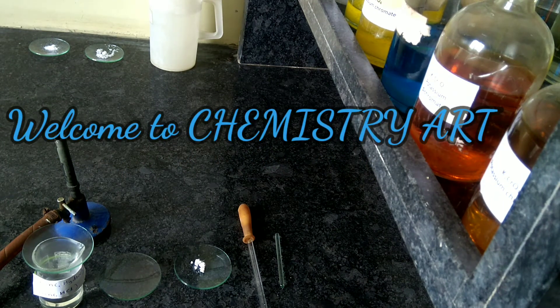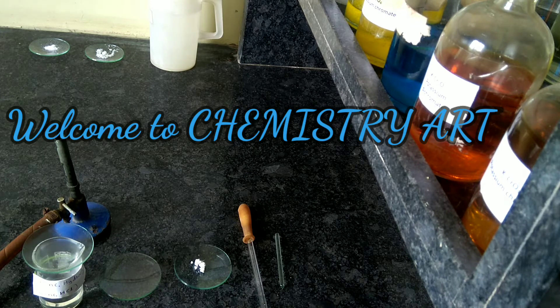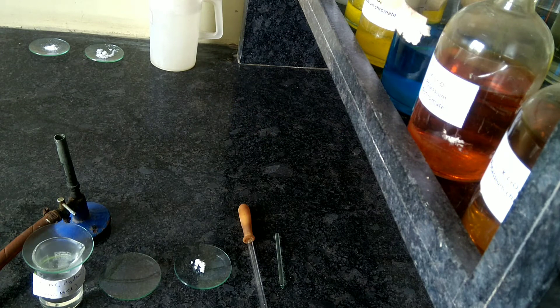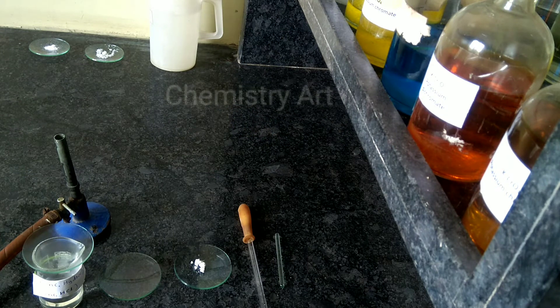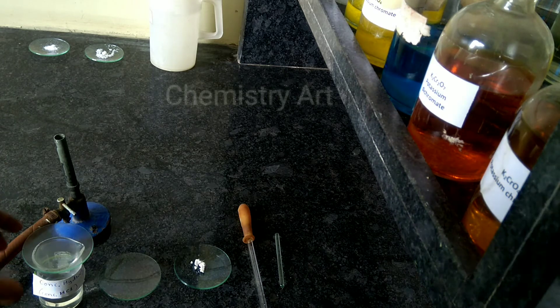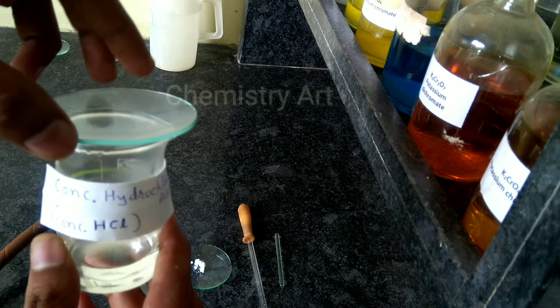Hello everyone, welcome to Chemistry Art. In this video I am going to show you how to check the positive ion in a given inorganic salt. The salt has a positive charge and a negative charge, and we can find out which positive ion is present with the help of the flame test.